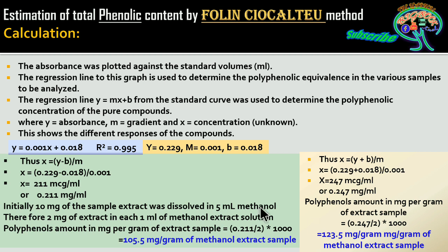These formulas and ways of calculation have been taken from well-published journals, not from any lab manual of colleges. Apart from this, there are many methods within the FCR itself used to analyze the presence of phenol compounds in plant extracts of any part of the plant.